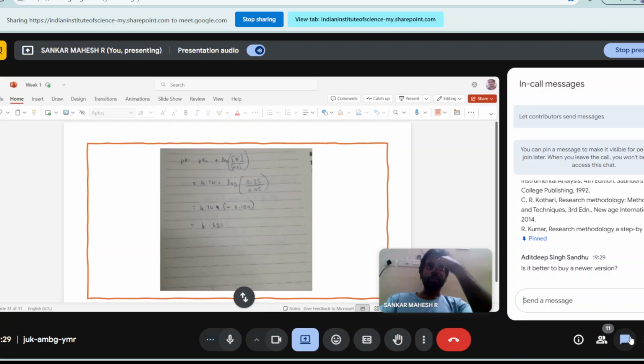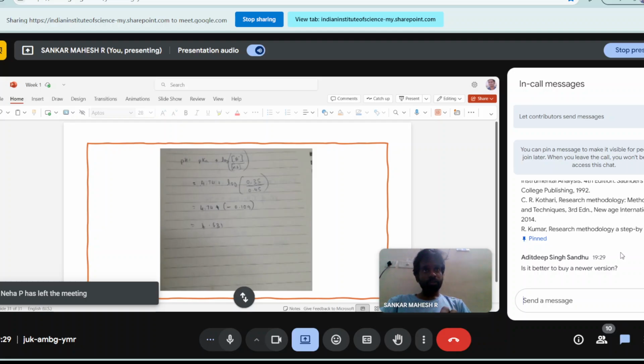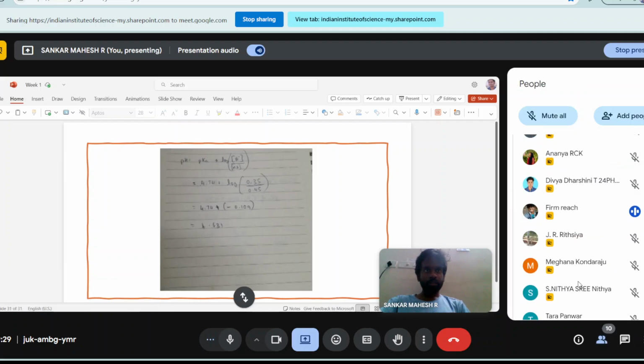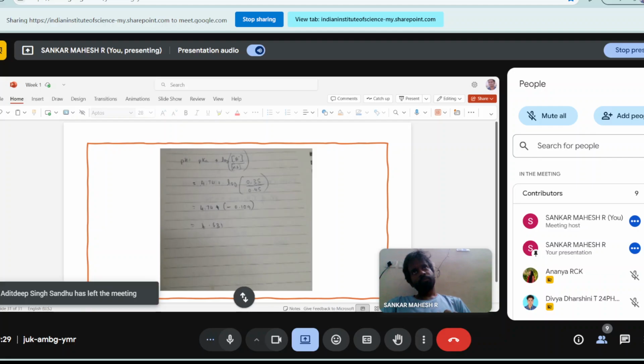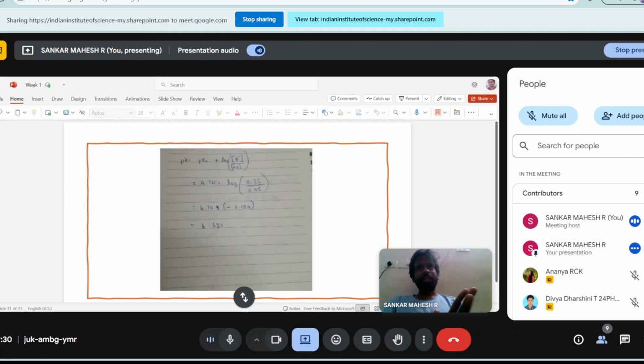Sir, earlier we discussed etching. Etching happens because of strong bases, right? Right, ethanolic KOH can cause etching. Sir, is it because of rubbing it, or will just keeping it also cause etching? No, silica, this is a chemical reaction. You need not put physical pressure there, although physical pressure can cause a different form of etching.